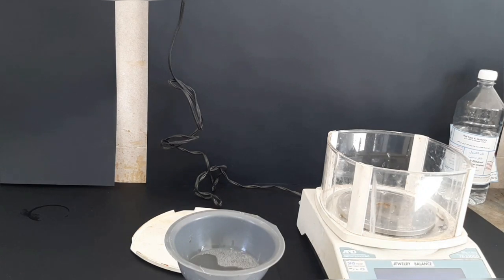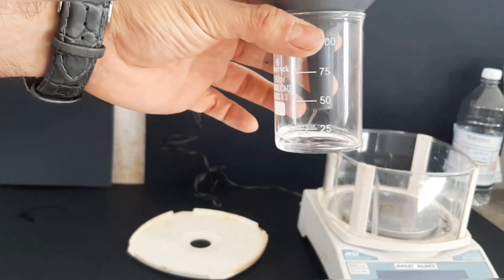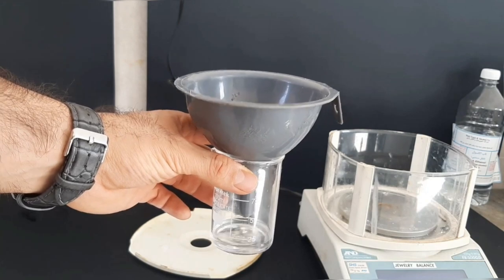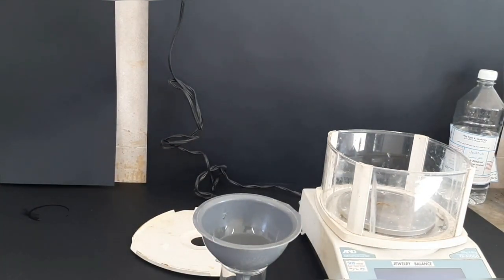If you're wondering why I'm using a plastic funnel, the funnel is made out of polyethylene, which is fairly resistant to ethyl acetate. So you can see our product has cleared up. The cloudiness is because of some of the calcium chloride particles that are very fine and they just somehow disperse through the product. You just have to filter it out.